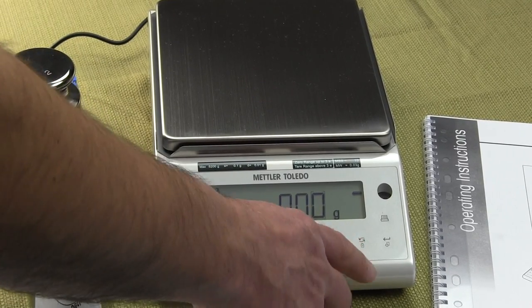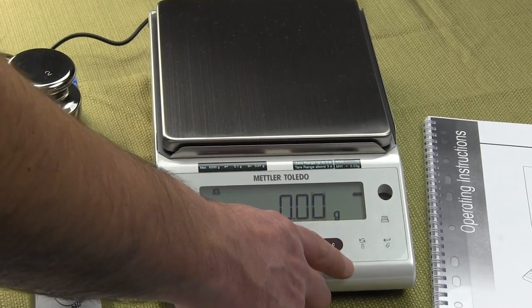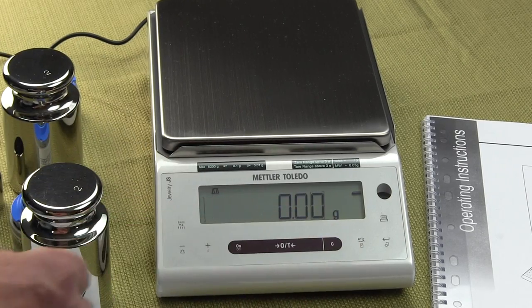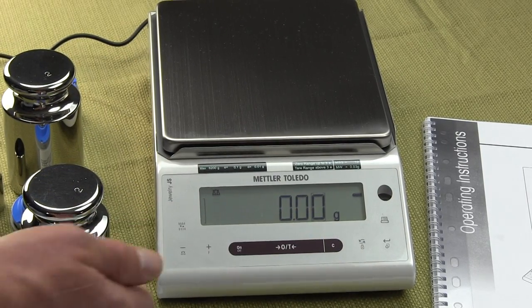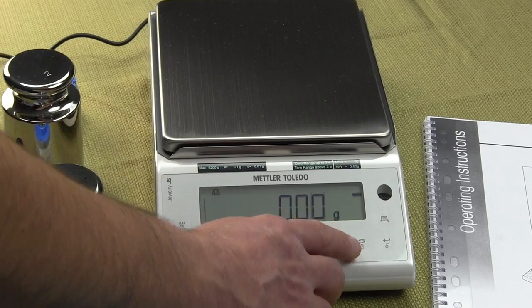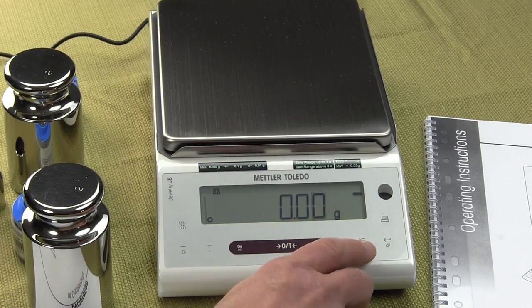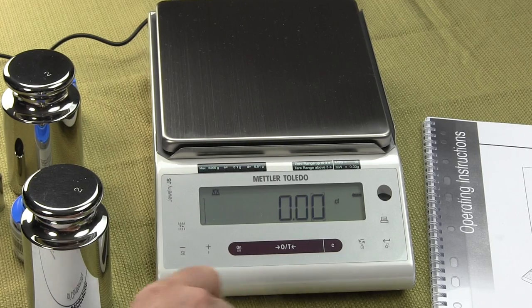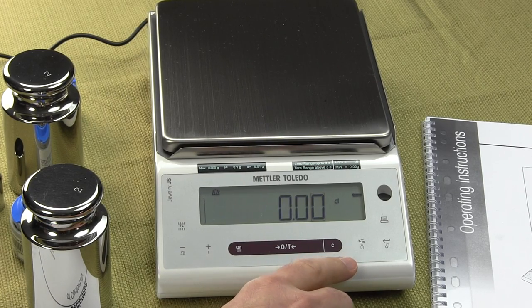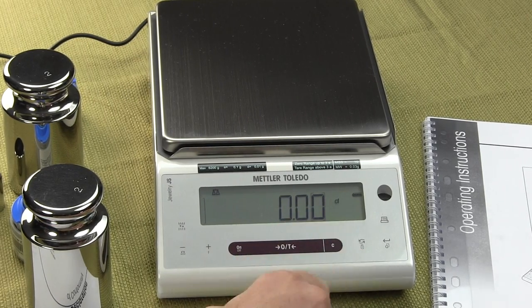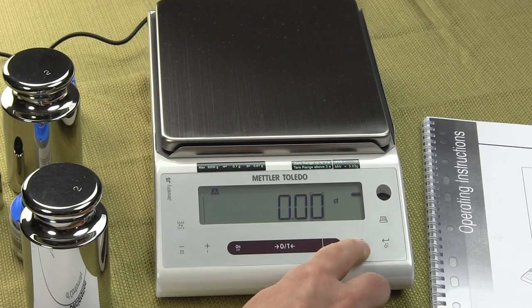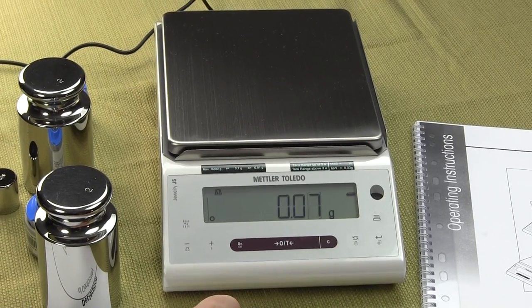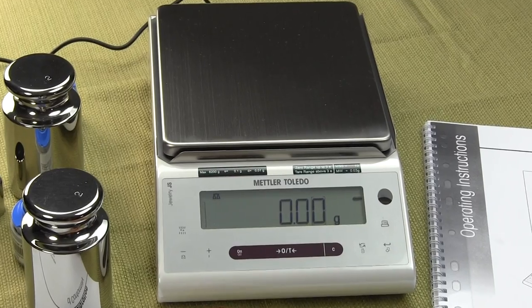This key right here enables you to toggle between a different weigh mode. Mettler Toledo says basically press and release is less than one and a half seconds. So if I just press it, you'll notice now I'm in carats. So the secondary mode on this balance is carats. Press it again. The primary mode is grams.